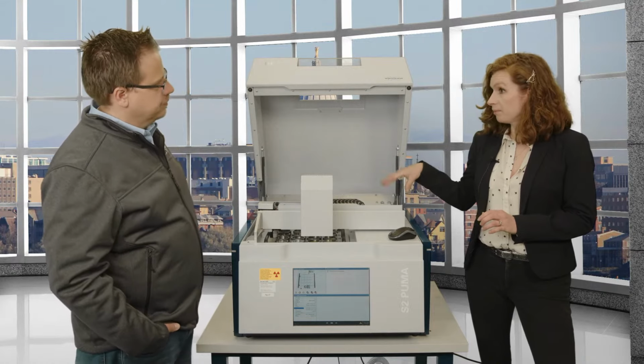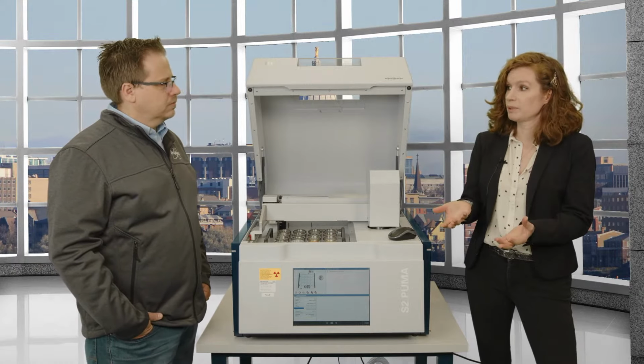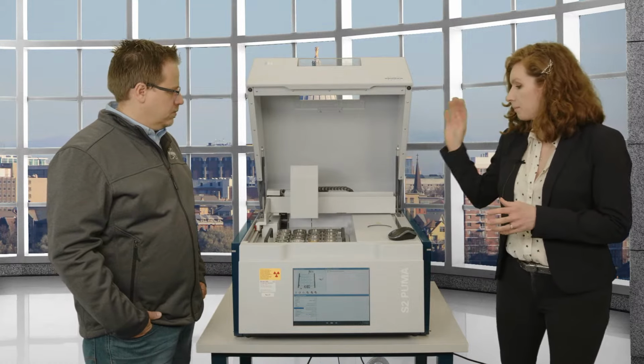That's, but only the closer sample measuring area, right? Okay. When we talk about WDXRF, that's very important, because with WDXRF, with all of those things in the beam path, that's always on a vacuum, and we only flush the sample measurement chamber. Okay. So this is running.